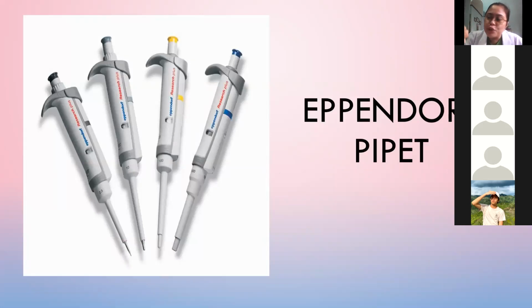So, di ba, when you want to drain the liquid from the micropipette, you have to push this button here, and then another push pa, mo na to siya ang air displacement. So the air will just push the remaining amount of liquid na naa sa Eppendorf para mahurot siya tanan. So blown out gihapon but using the air para mag-get rid ang liquid sa Eppendorf pipette.